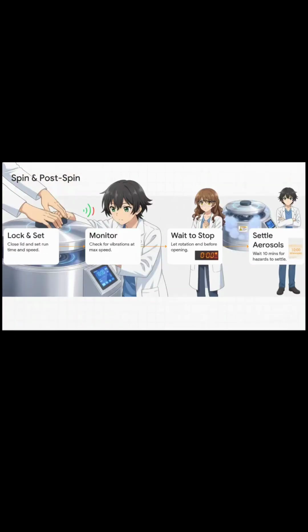And once that spin starts, your safety protocols definitely aren't over. You lock the lid, configure your settings, but you absolutely do not walk away. You've got to stand there and monitor the machine as it ramps up to its maximum speed. You're listening for any odd noises or violent vibrations that might hint at a balance issue.